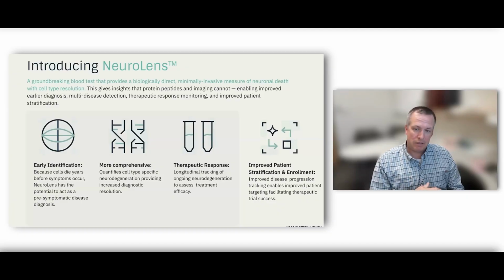For us, I'll introduce you to this one assay that we call the NeuroLens assay. This was developed by myself and the co-founder of Wasatch Biolabs, actually. His name's Chad Pollard, who was a graduate student at the time with me. I've leveraged DNA methylation analyses in my own lab for many years and have focused on tissue of origin prediction using methylation for that purpose.